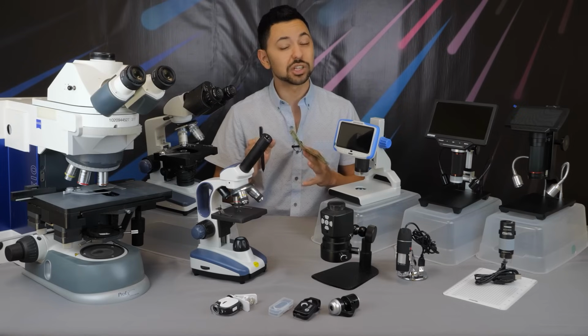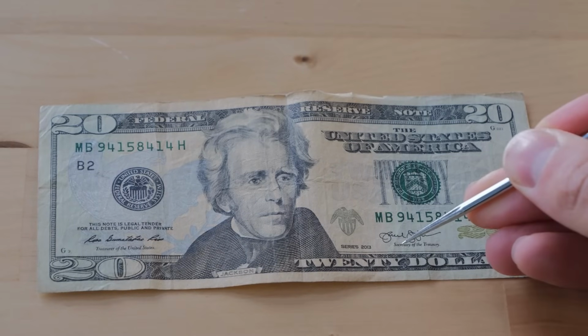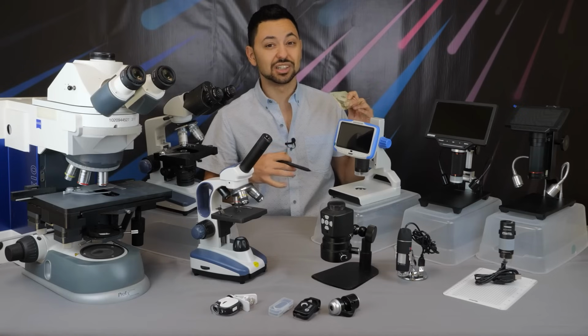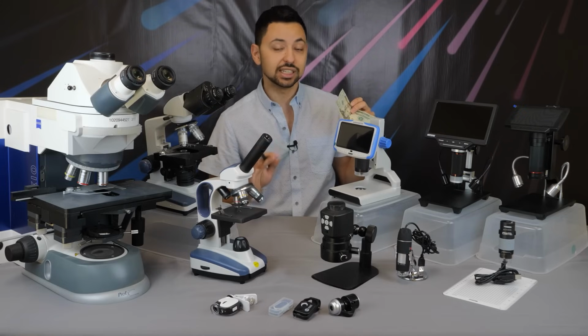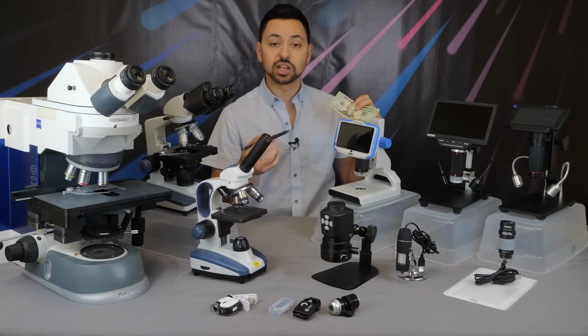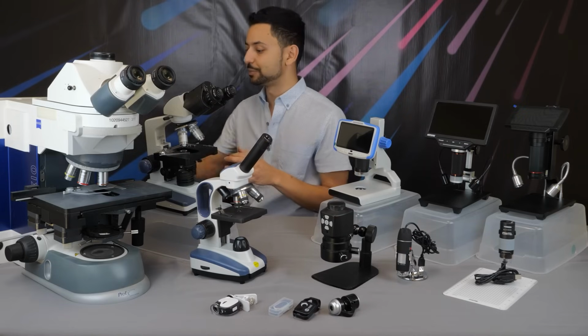Please note that I'm not going to be talking about magnification very much in this video at all, especially for anything on this side of the table, specifically because looking at magnification alone is a very misleading thing for new people that are getting into microscopy. If you'd like to learn more, you can check out my USB Microscope live video.